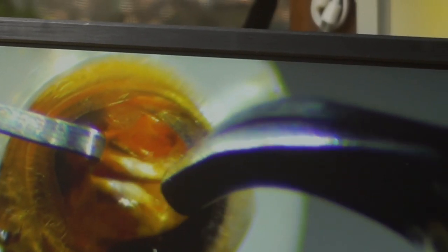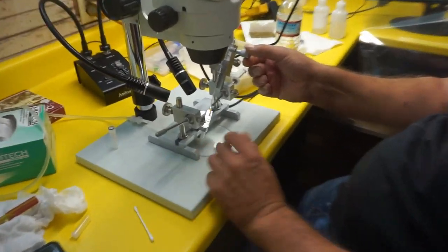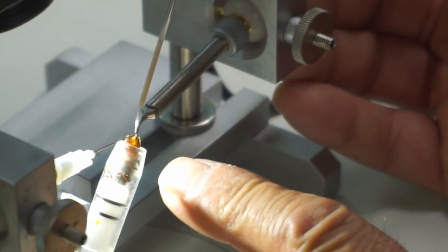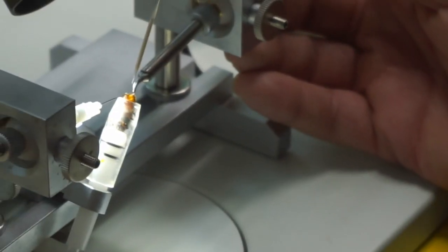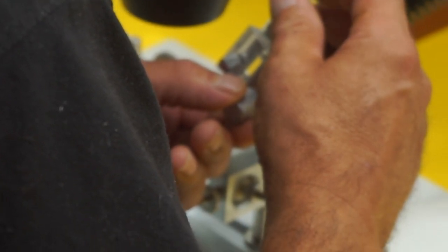Okay, so the stinger is right there, but I've got, there's two little meat pockets on either side that I gotta be careful of. That's the stinger. Right there. And you try to grab that with your pincher? Yes. Here we go. One thing I have to do is make sure that my hook is not gonna be hitting my tube, right? So that's gotta go down. Come on. She's in. See it going in? Yeah. Look at that.